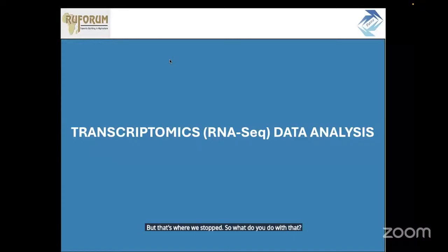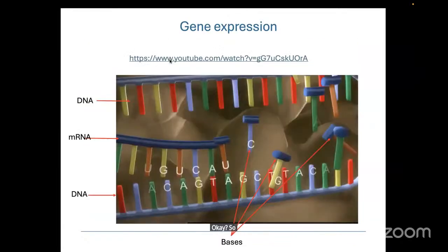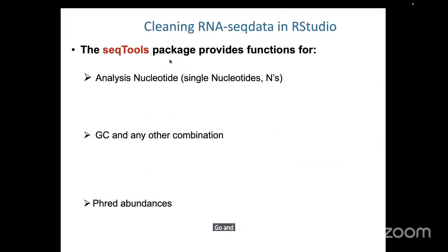Next, we have two steps left. We're going to do the gene expression analysis, and then after that, we're going to do the downstream analysis. That's where we're going to start from today. So I will go and start from there.